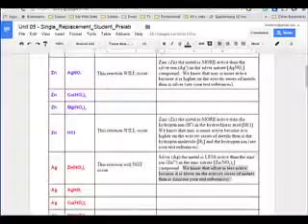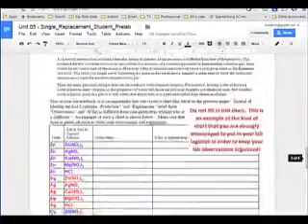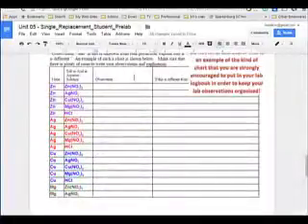Now then, I want to jump down to the bottom of this document, a couple pages away, and I want you to go there with me and get out your lab logbook. You're going to finish the chart here for predicting whether reactions will occur later. It's homework. Right now I want to show you what to put in your lab logbook to prepare to collect data for tomorrow's lab. This chart kind of gives you a good start on how to do that.